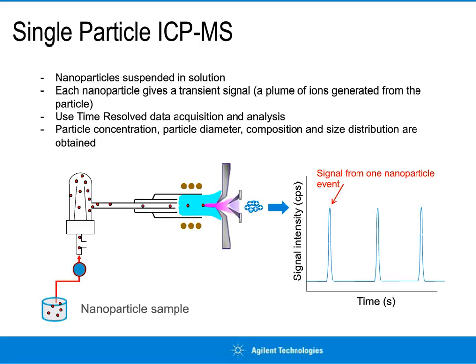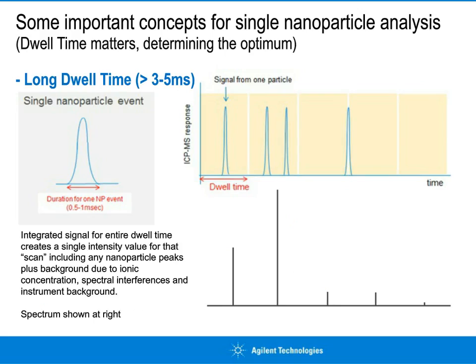So it's quite simple, but there are some issues to consider. And one of those is the concept of dwell time or integration time or scan time. There's different ways to describe that. But when the ICP-MS is looking at a particular signal, it acquires that data and integrates it over a certain amount of time called the dwell time.